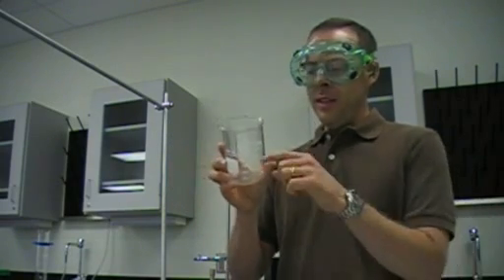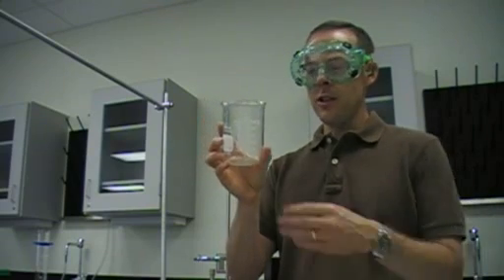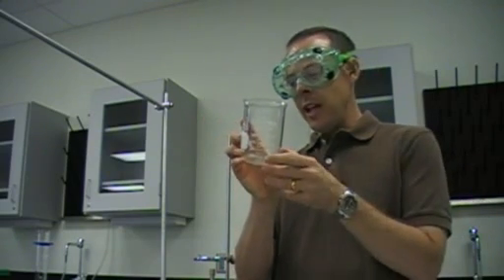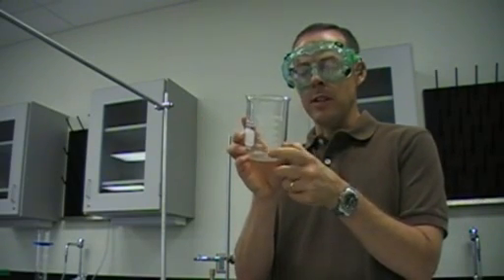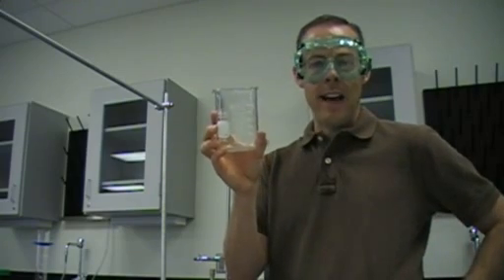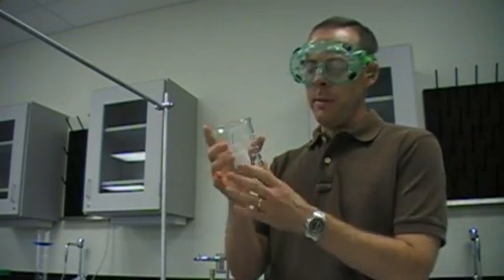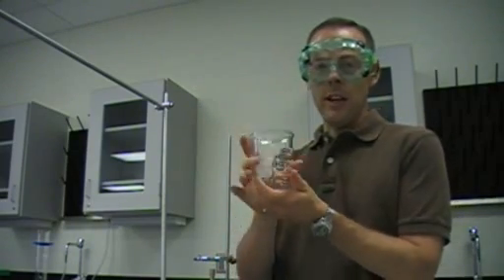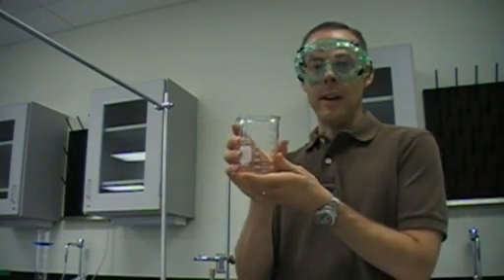Essentially, this is something that if I ask you to get an approximate amount of a liquid, water or some other chemical, but typically water, these markings are not real accurate. They're just going to give us approximates. Notice they change by 50s, and there's a line between, so really 25 milliliters would be as accurate as they could be. These are mass produced, fairly cheap, so these lines are not measured or marked to any real high degree of accuracy. If you need an approximate amount of a liquid, this would be a great way to get it.